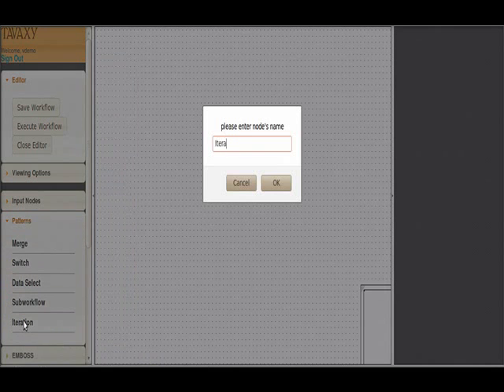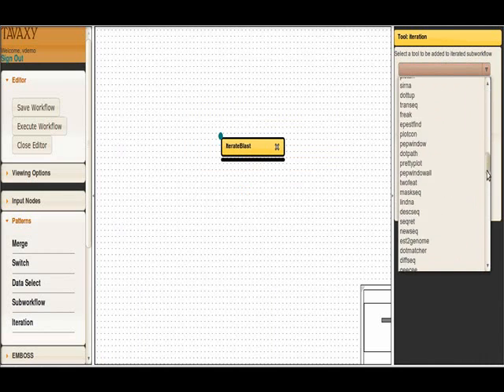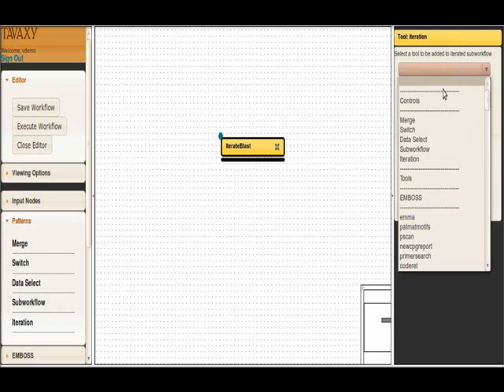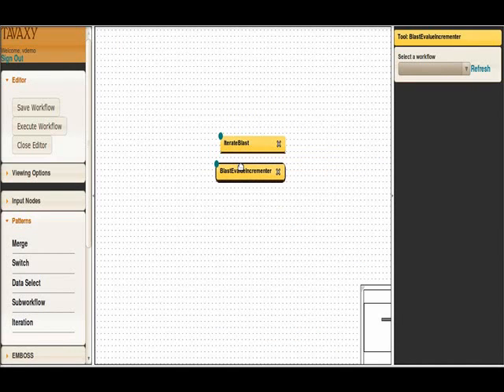And we'll now be demonstrating the iterate pattern. So we'll be iterating this BLAST until the output's done, i.e. it outputs more than the 20 hits. This is the list of all nodes that can be added to the sub workflow that we will be iterating, and this is the condition: when will the iteration finish, according to which port and to what value, and the while node. We'll be adding the e-value incrementer sub workflow.